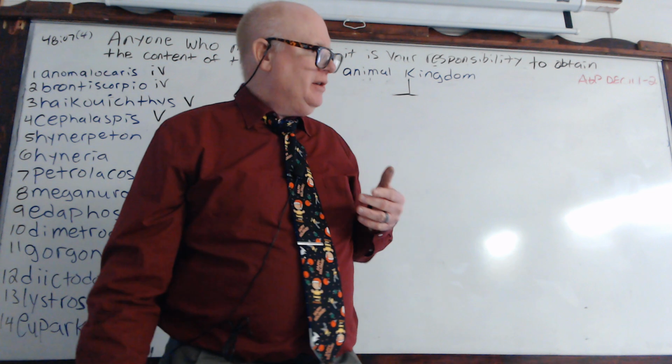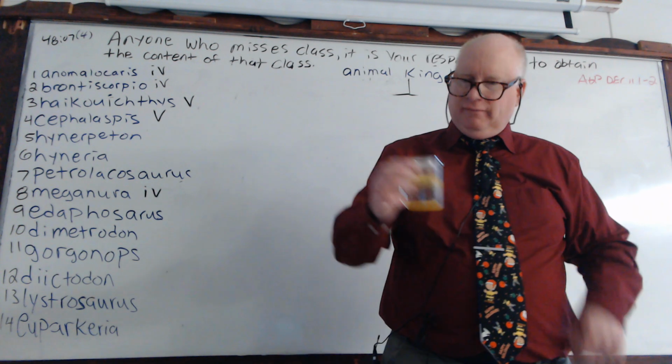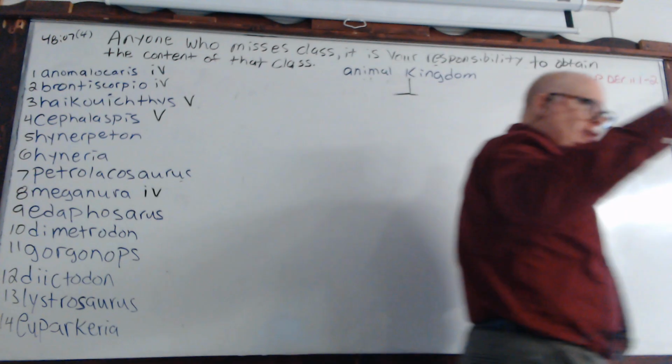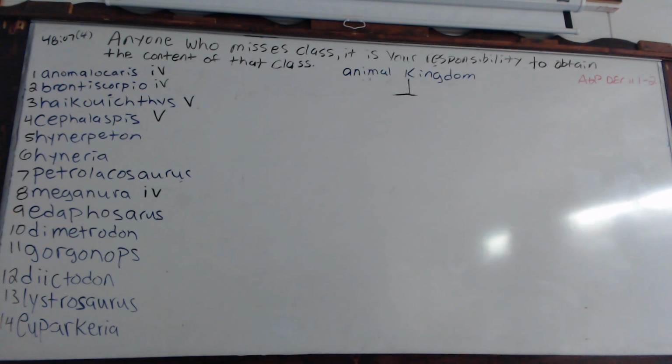Okay, so we'll go ahead and get started. From yesterday's presentation, look at what we have here, okay? Because when you had left yesterday, what did this look like? It was just the whole solution was yellow.